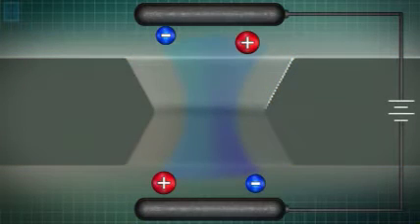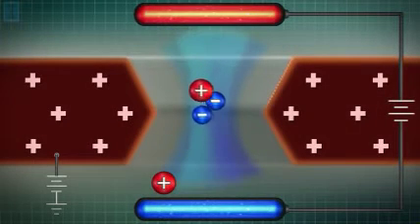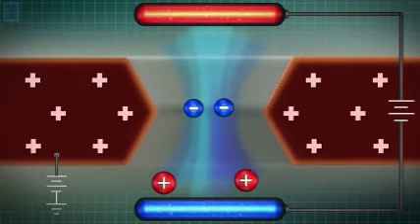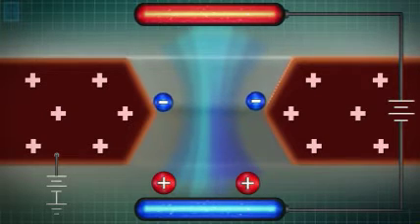To review, a membrane and pore immersed in ionic fluid and bracketed by charge plates cause a field within the pore. This field causes entities within the pore to migrate to the corresponding charge. A manipulation in membrane bias creates a change in the field gradient in the membrane pore.